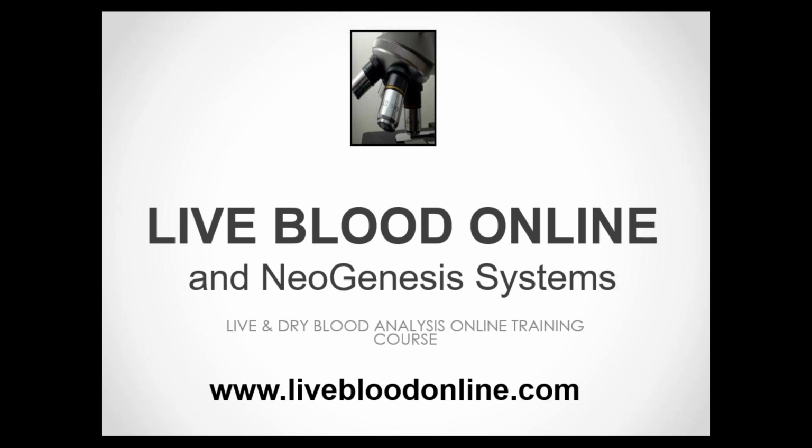So, Dr. Okker, thanks for joining us. Would you please explain, first of all, what exactly are dark field, bright field, and phase contrast? Are they lighting systems? What are they and how do they work?